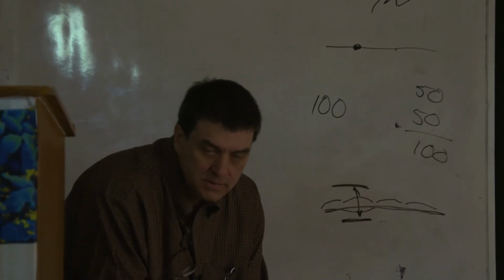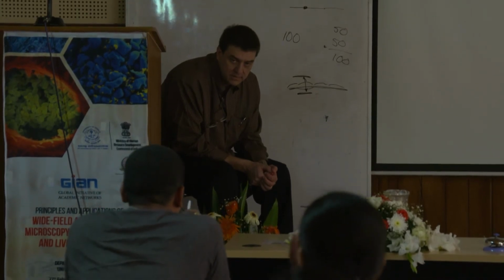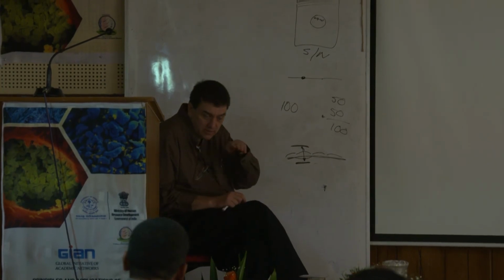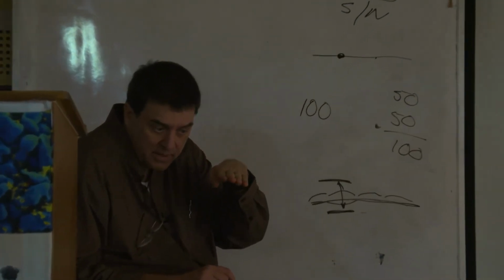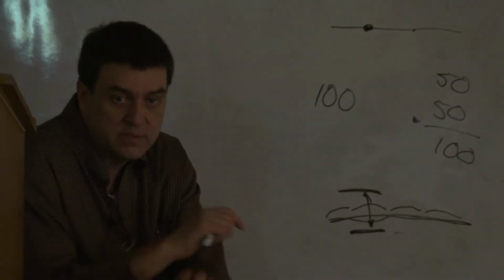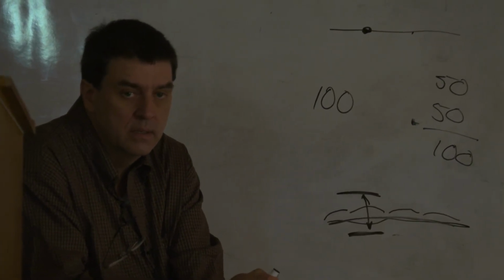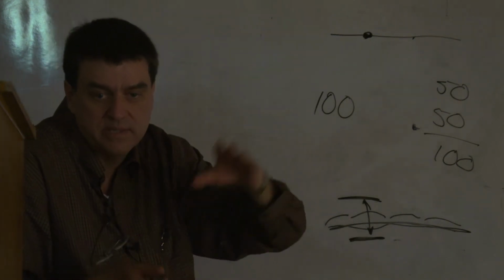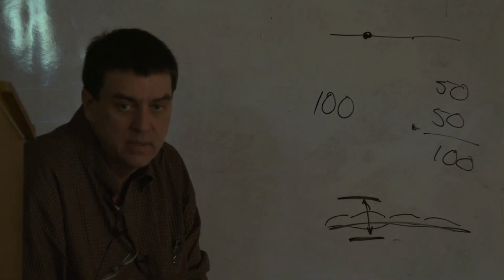Suppose we are looking at the nucleus specifically. Yes, so same idea. You would focus on the nucleus, and you'd start to move up and see where you're not in focus anymore and stop, and go down where you're not in focus anymore and stop. And you would just then get the nucleus in terms of Z. Because again, if you're just looking at the nucleus, why take all this above it and below it? Just take close to it. You always try to go a little bit above it and a little bit below it.